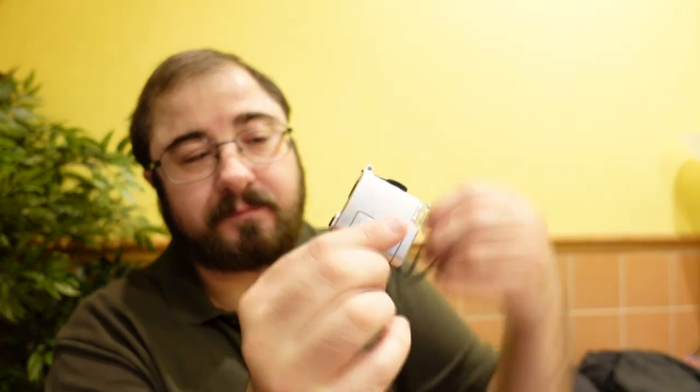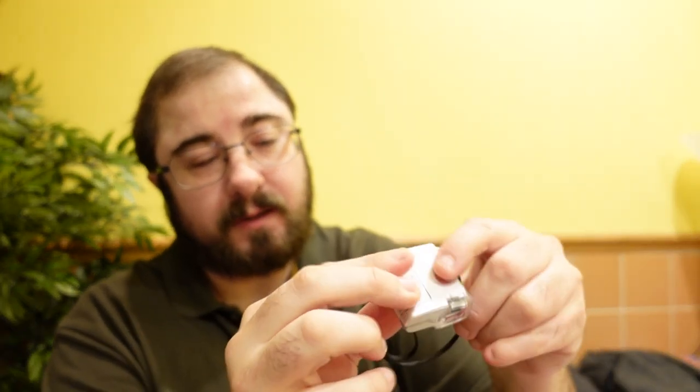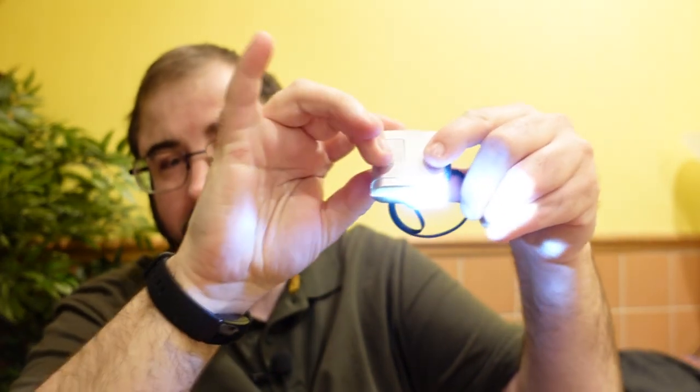This is your little pouch — got a little bit of velcro, a little lanyard case. And then we open it up and there it goes. It does have a little light on it so you can illuminate your subject while you're looking at it.